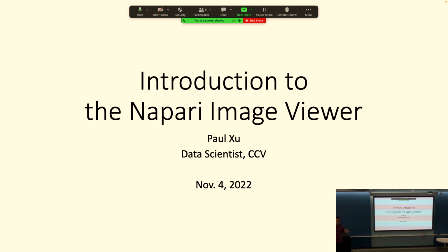So folks in the medical and biosciences might have lots of volumetric images or images that are collected over time that they want to visualize. And Napari is very good at specializing in that.